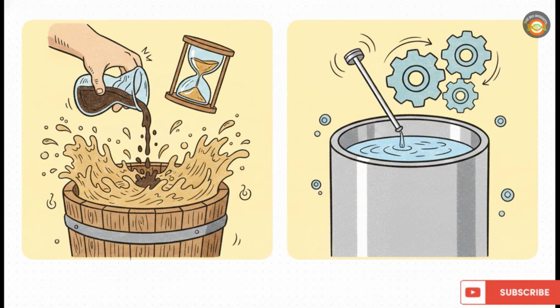Today, though, we use sterilizable probes that sit directly inside the fermenter. These things are automatic and continuous. The absolute second they detect a spike in acidity, they automatically trigger the injection of a powerful base, usually anhydrous ammonia, to instantly neutralize the broth. It turns what used to be a chaotic, reactive chore into this beautifully smooth, automated balancing act.